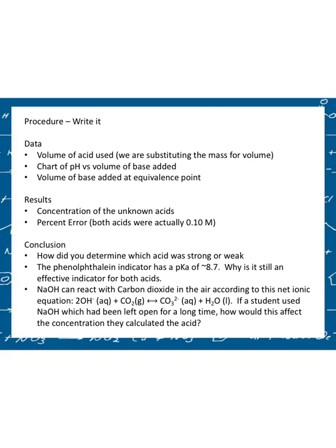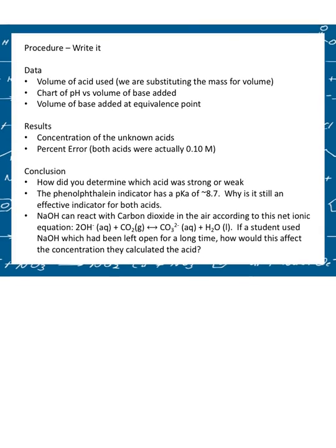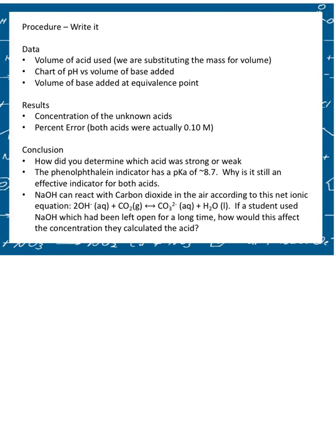And the other data point that you need for today's calculation is the volume at the equivalence point. The pH values that you recorded with the pH paper, you don't need that for an actual calculation. We'll deal with that in the future. But for right now, I want to walk you through a sample calculation to get the concentrations and the percent errors. So bear with me as I remember how to play with this program, and hopefully I'll get better as we go on.